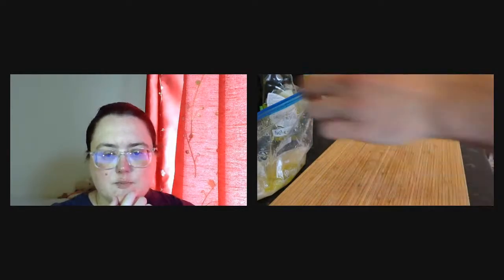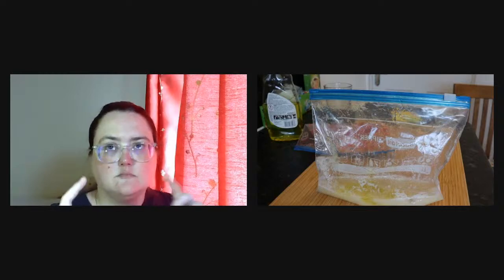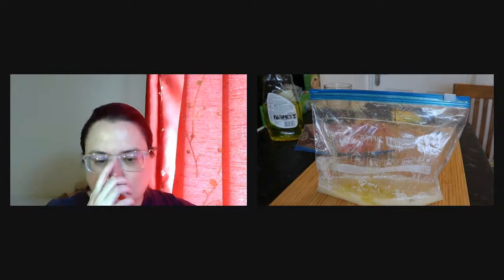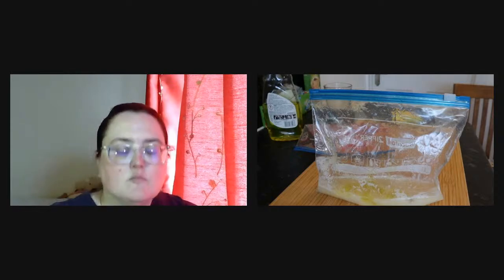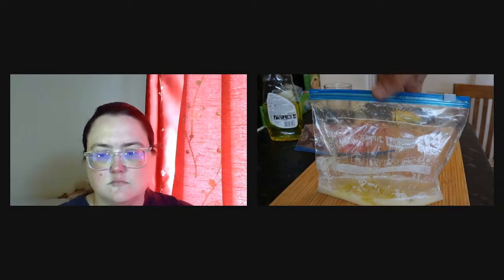So why are we using the washing up liquid? Yes. The washing up liquid is actually made of molecules that will break down those protective layers that are the membranes that are around the cells. So we actually cut the fruit, mash them, so we broke the cell, and now we are going to break the membranes that are making that protective layer, so that we can extract the DNA that has been untangled by the salt. So this is how we can prepare ourselves so that we will be able to extract that DNA.